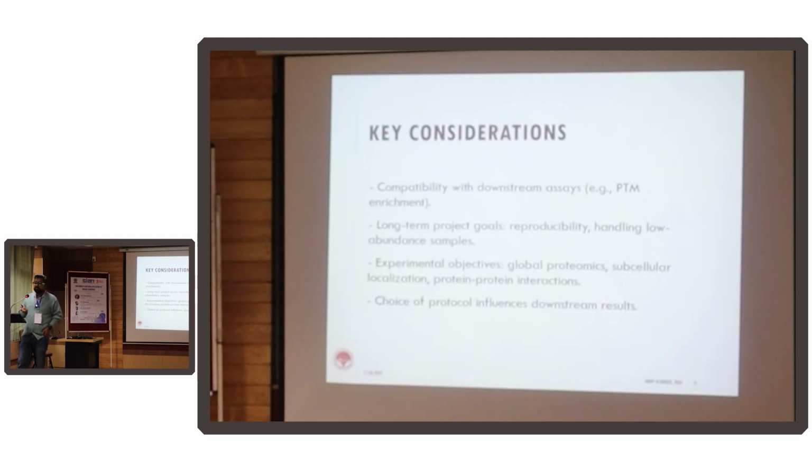You want to do cell membrane proteomics, then you have to do something else. You want to just do the cell surface, you want to go for protein-protein interaction, again, separate set of experimental design. And ultimately, the bottom line is, your choice of protocol will define the results you get. But then you cannot blame us, or especially Professor Graham, that he taught us wrong, and all the results we got is not what we were expecting, because you started off wrong. So the data analysis part comes much later. This is something that you can do at your own lab.